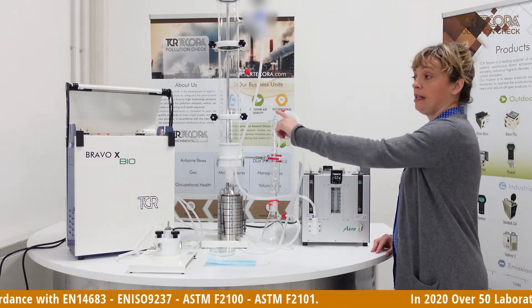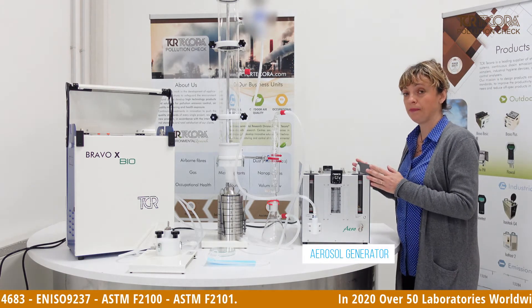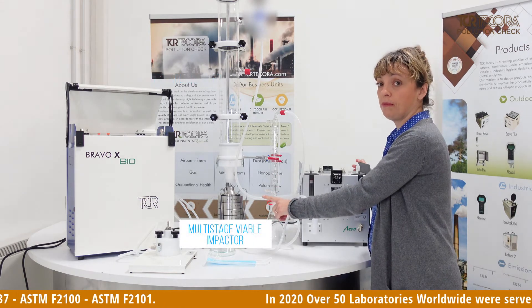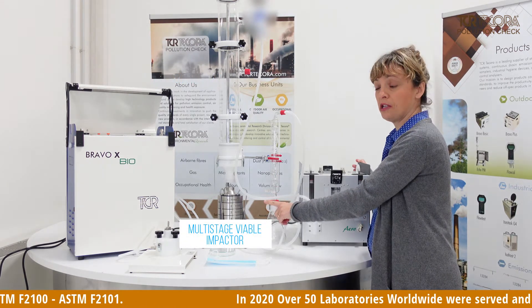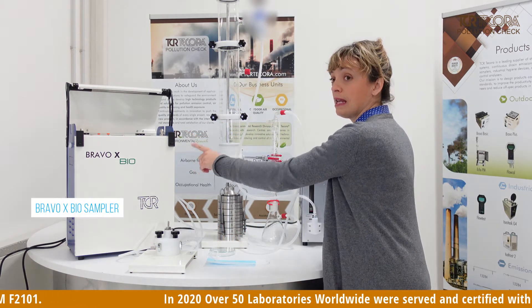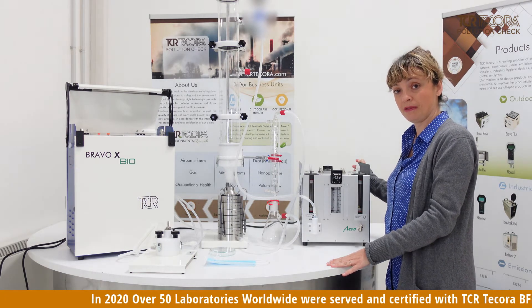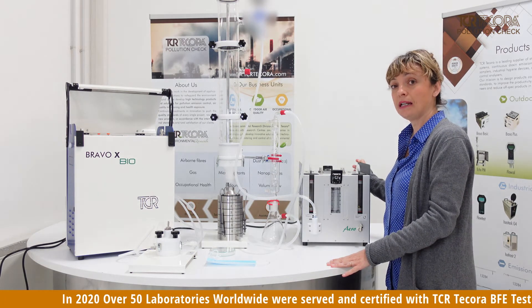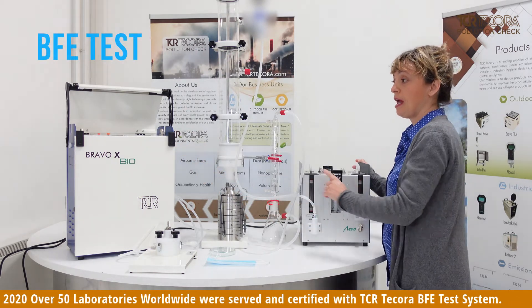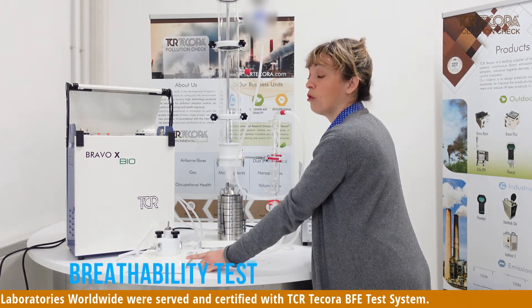Here you can see the complete line, starting from the aerosol generator, the aerosol chamber, the multistage viable impactor, the Andersen-type multistage impactor, the condenser, as well as the sample holder. This sample holder was developed specifically for BFE and breathability and lets you perform both tests — the BFE configuration and the special sample holder for the breathability test.